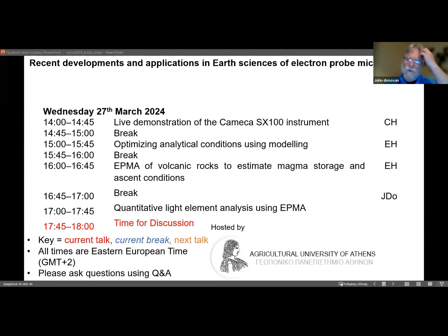And the reason for this is that if you pick 2 points to measure your backgrounds on, it might work. And if you do careful wave scans and you pick your backgrounds very carefully, it might work in one material, but it might not work in a different composition, even a different monazite composition, because what they had was problems with elements that would just happen to be in that little area of the crystal, whether it's sulfur or some other element, and it would interfere with the background position of one of those 2-point backgrounds. And it's a sloping background. So you do need 2 points to measure the background slope. And also, some of those backgrounds are curved. Okay. But instead of measuring just 2 background positions, you can measure 3 or 4.